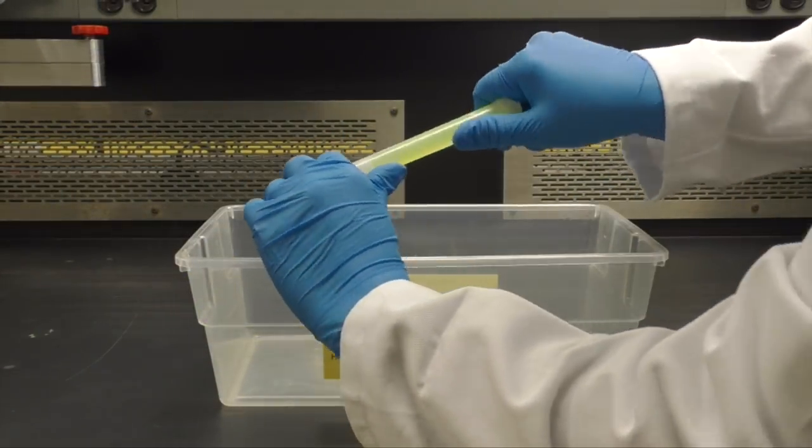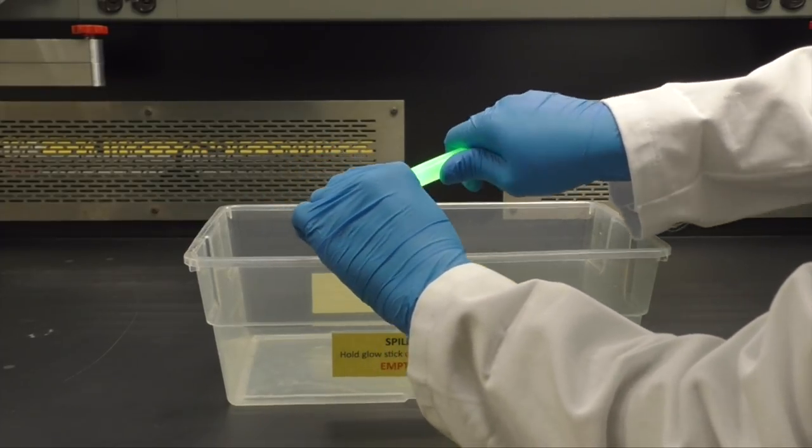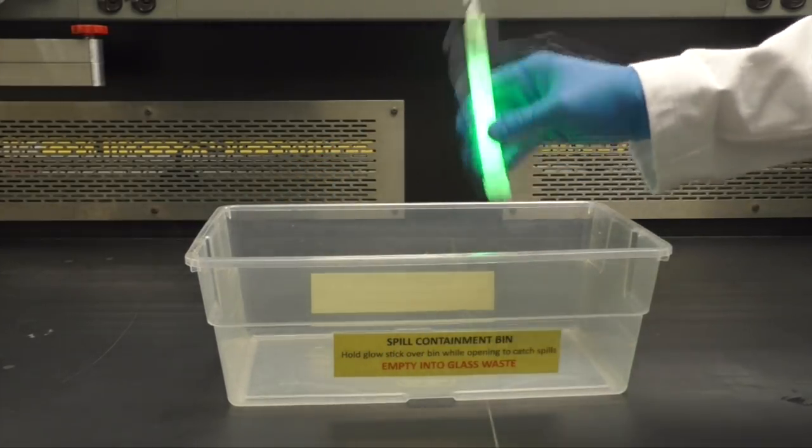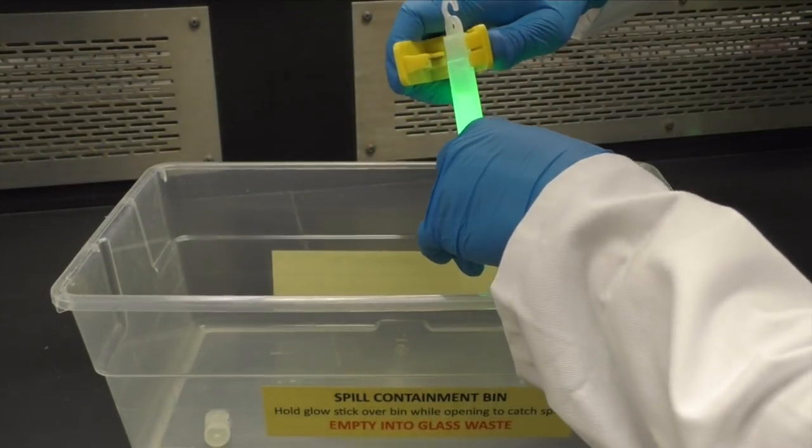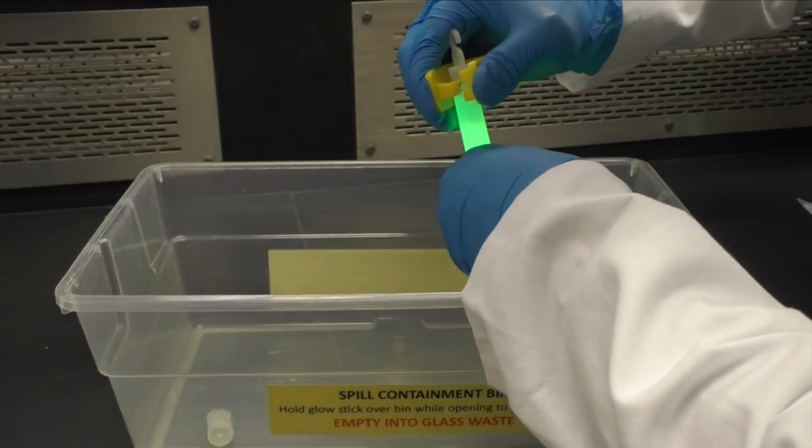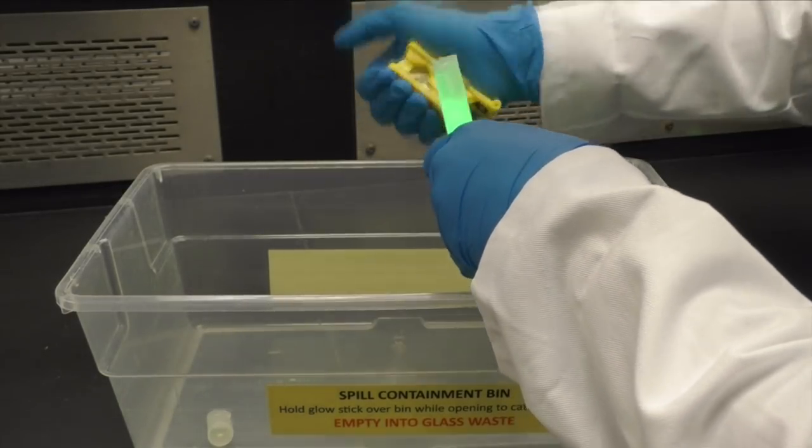Activate the glow stick by snapping the inner glass tube and shake it well so it begins glowing. Now hold the glow stick upright over the spill bin and apply pressure to the top part of the glow stick using the tubing cutters to snip off the top.